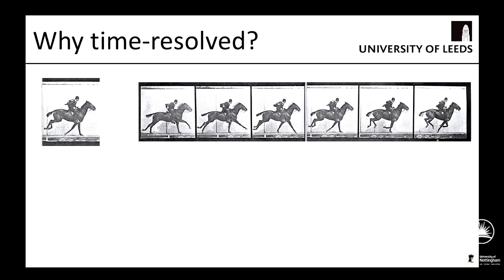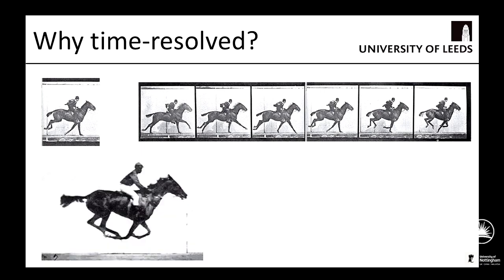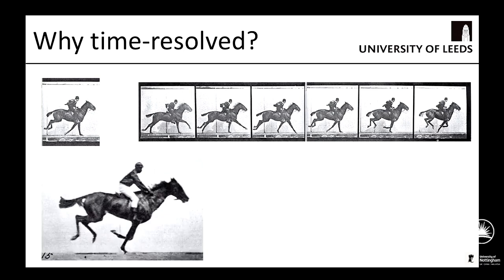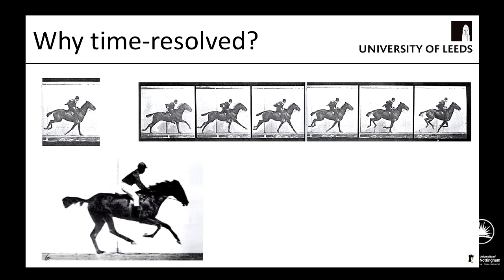And this is one challenge in EM. You may start a reaction and you may be able to trap different conformational states, but how do you assign which state occurred before the other one, and how do you assign the time points between each one? And when we have all this valuable information, we can, of course, make these nice molecular movies, which we can then integrate with other biophysical techniques and biochemical analysis.